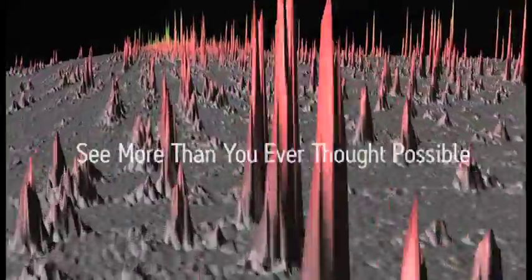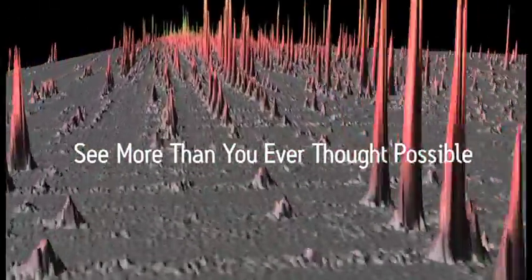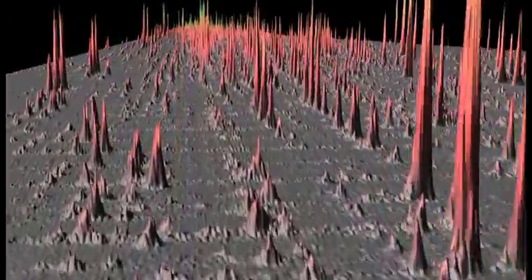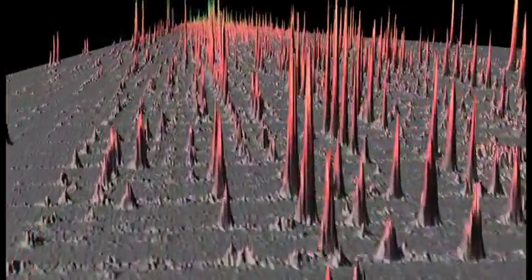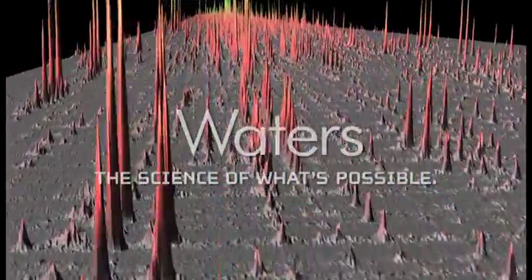Now you can see more than you ever thought possible, all the time, in all samples. And you can see it now. We invite you to speak with our experts on how this new ability to see everything can transform your applications.